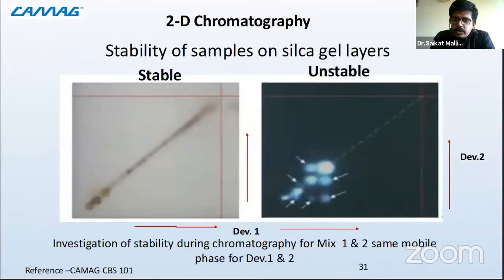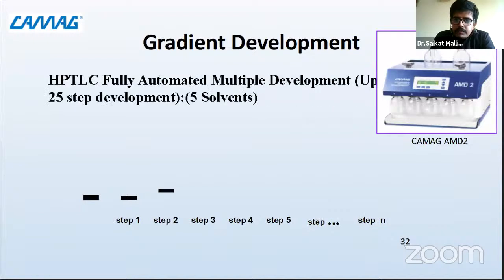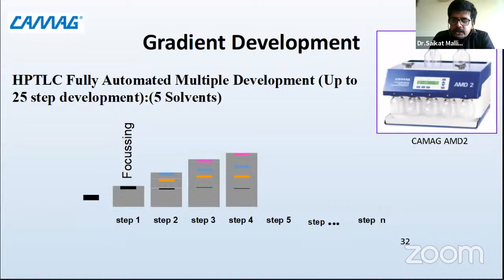You can do 2D chromatography. I'll go a little bit fast from here because we are running short of time, and I do want to show you the video, which will be much more informative. Also, the application parts, I will be taking some time.